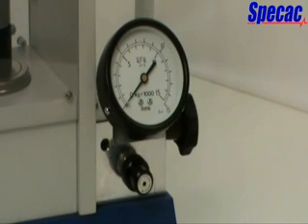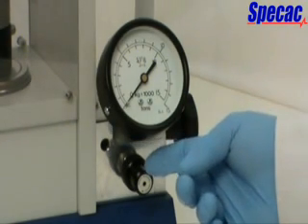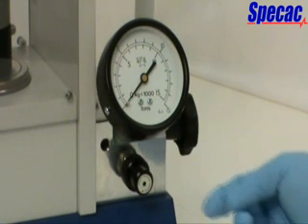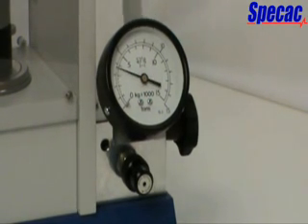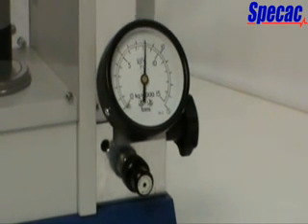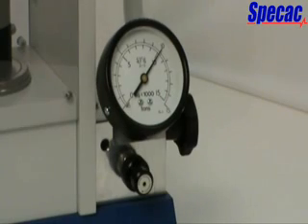Beneath the tonnage load gauge there is a pressure relief valve which may be set so that any load between 0 to 15 tons is the maximum load that can be obtained. The relief valve screw cap knob can be rotated clockwise to increase the maximum oil pressure in the system and hence the applied tonnage load, or rotated anti-clockwise to decrease the pressure in the system and the applied tonnage load. This is a useful feature for pressing applications where a maximum load limit is required. For example, 10 tons is the maximum load limit for use of a 13mm evacuable pellet die.